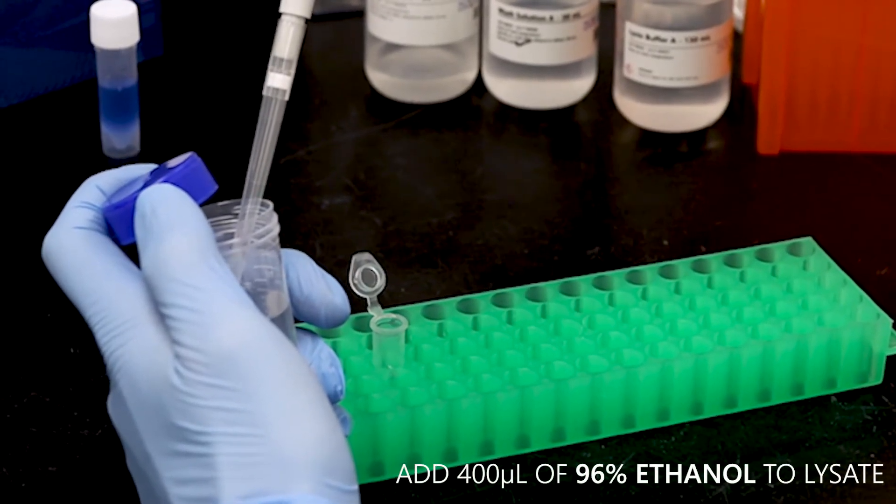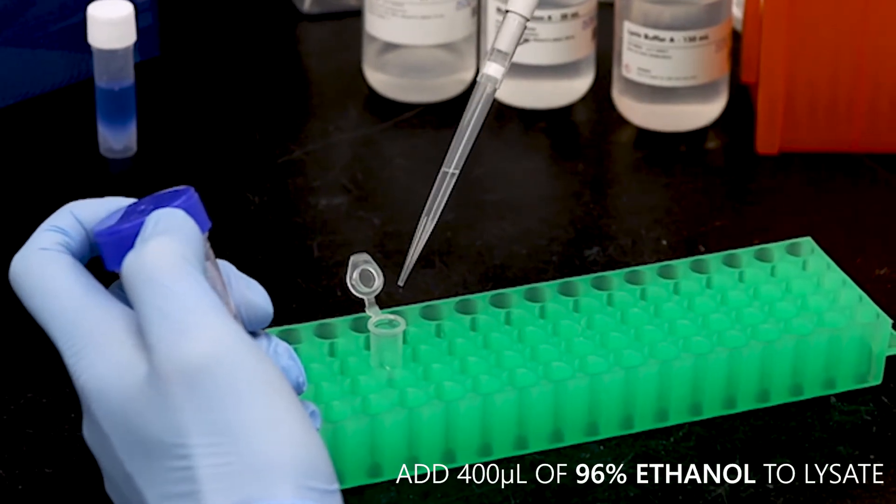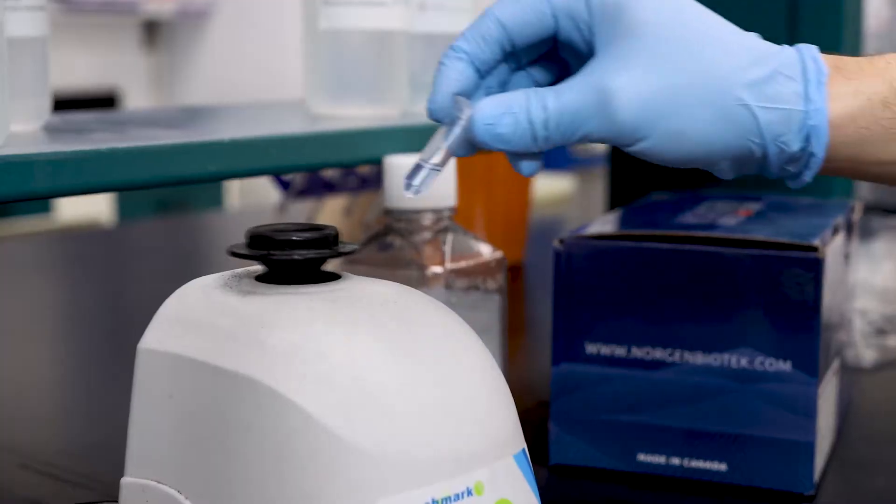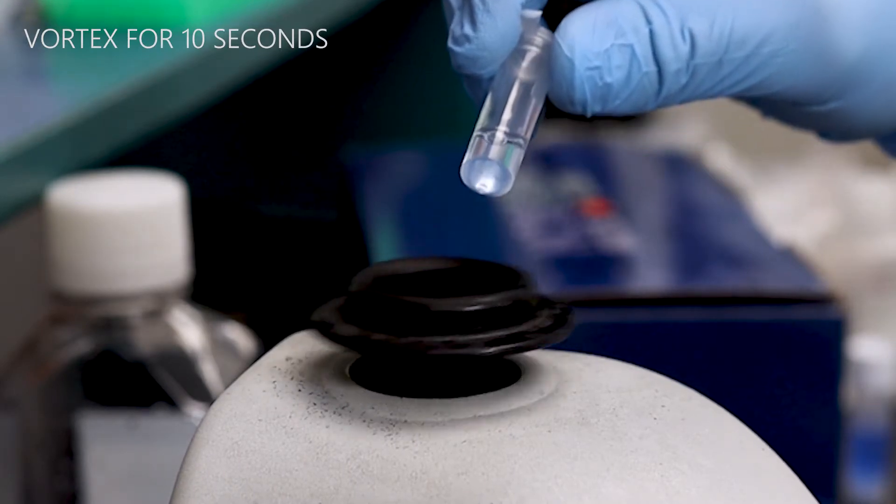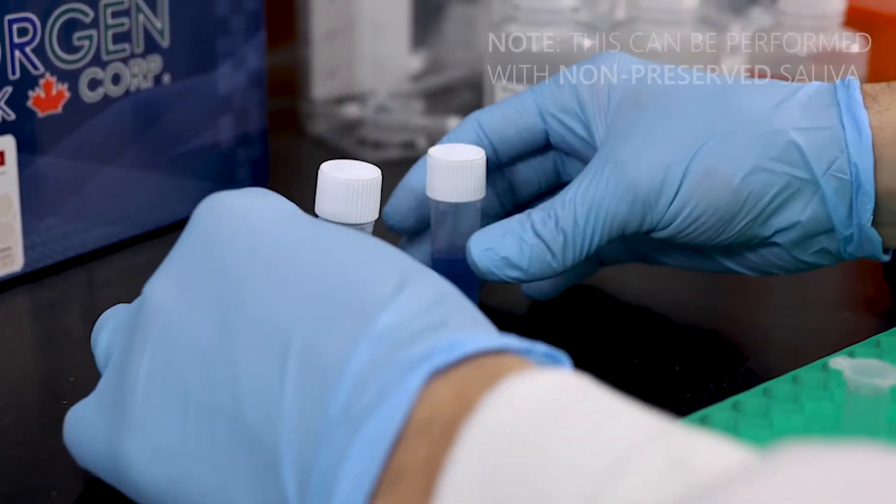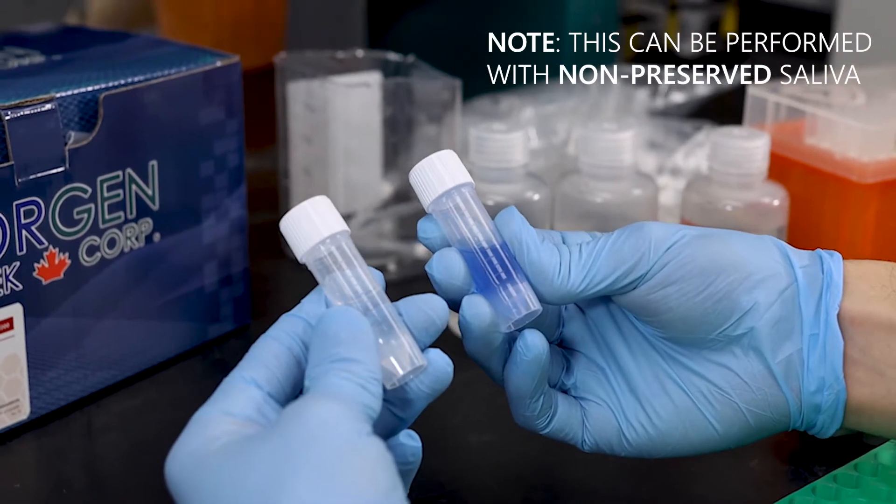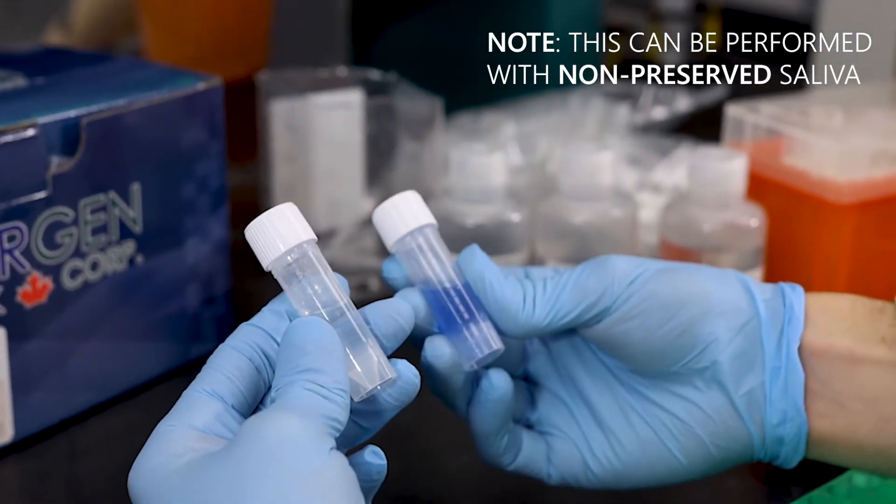Then add 400 microliters of 96% ethanol to the lysate. Vortex once again for 10 seconds. This procedure can also be used to isolate RNA from fresh saliva and swab samples.